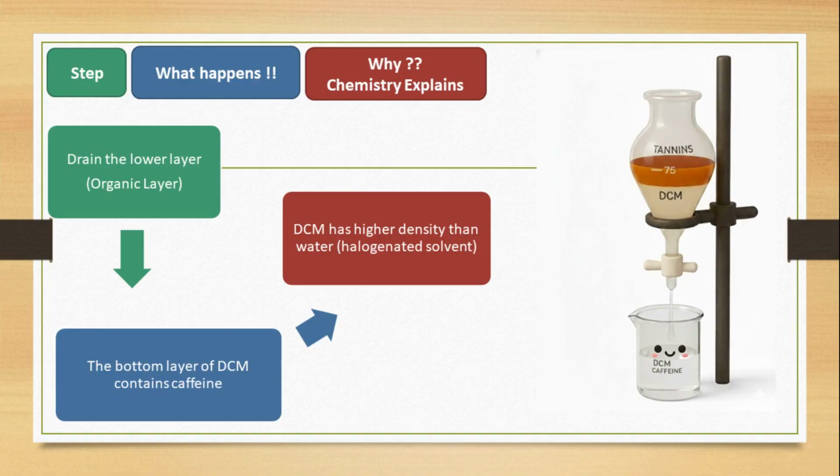Once mixing is complete and the layers settle, the lower layer containing caffeine dissolved in DCM is drained from the separatory funnel into a clean flask. The choice of DCM is ideal because its higher density allows easy separation from water.